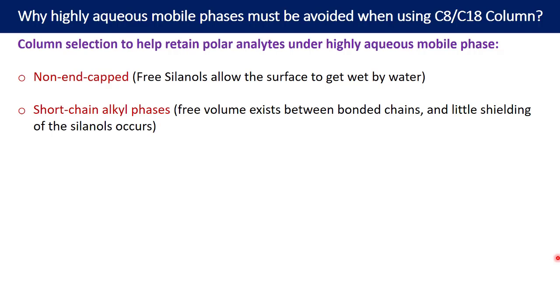Use short-chain alkyl phases such as C3 or C4. These are not popular for routine small molecule analysis, but with highly aqueous mobile phases you will get better results because they have free volume between the bonded chains and partial shielding of the silanol groups occurs, helping to keep the stationary phase wet. Also use hydrophilic stationary phases, since they will easily be wetted by aqueous mobile phases due to the like-attracts-like principle. Hydrophilic stationary phases include amine, amide, phenyl, or pentafluorophenyl phases.